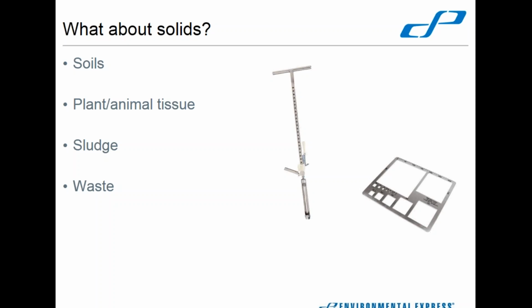And the sampling parameters are collecting, again, larger amounts of soil to use that sampling in an attempt to get a more representative value, to get a better overall average of the entire site, as opposed to just individual locations.